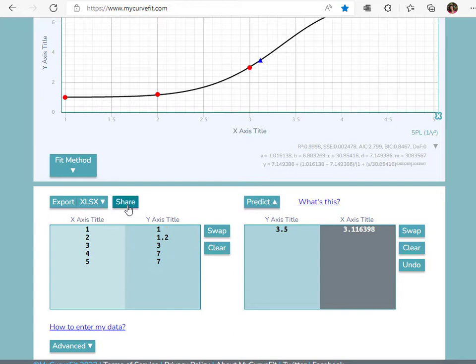Use the share option to share your results using a unique link. For more information on using MyCurveFit.com, please see the associated videos.